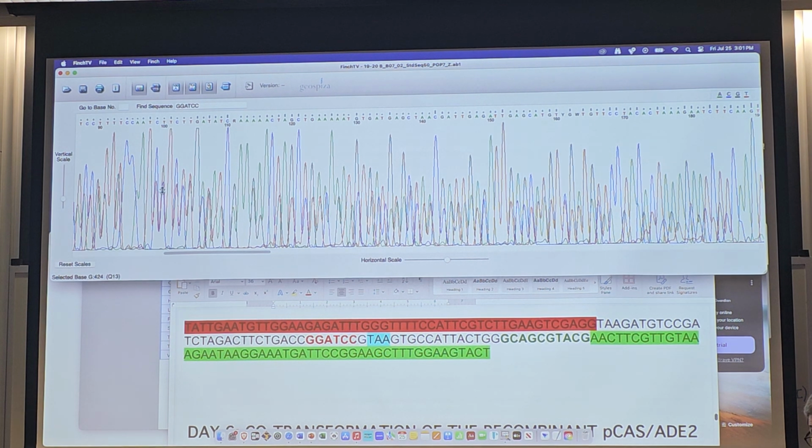So if you're sequencing 2 things simultaneously, that's what you get. At some positions, the nucleotides are going to be different between the two sequences, and so you're going to see something like this, right? Now here, where this T is, you don't see that, and that's probably because the real sequence that we want, and whatever this other thing is, both have a T at that position, so we get this big T and no underlying sequence there. But then the nucleotide before it, we've got a red T and again, blue C.